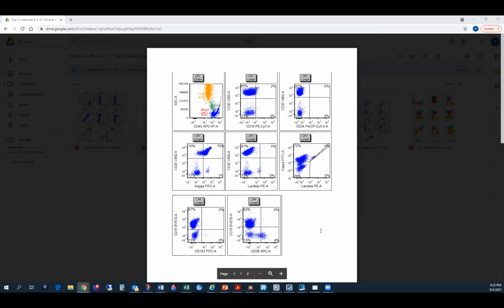And this one, I do not know the reason for this, but that blue population has a tail going up. Is it that the cell size is bigger and they are going into monocyte? I'm not sure what exactly that means. I have a feeling it's a washing problem, like the tube needs to be washed. Or I've seen that when there wasn't enough volume, and then the instrument sucked the tube dry. It is an artifact. I know that it is an artifact. I don't know the reason for that artifact, but maybe Halima knows what it is. But it is an artifact, so you have to ignore that.